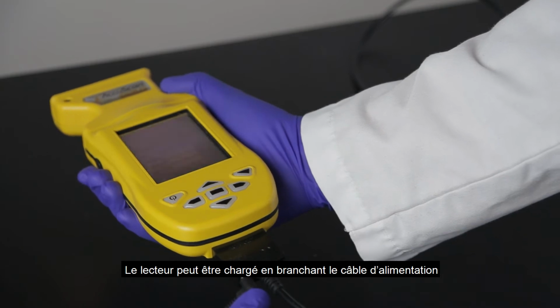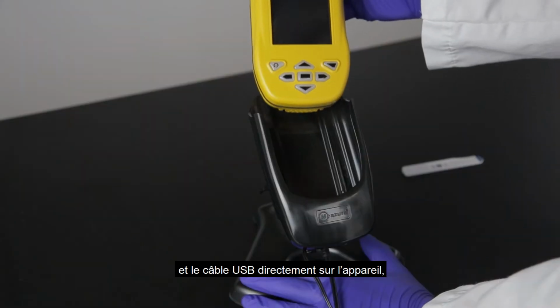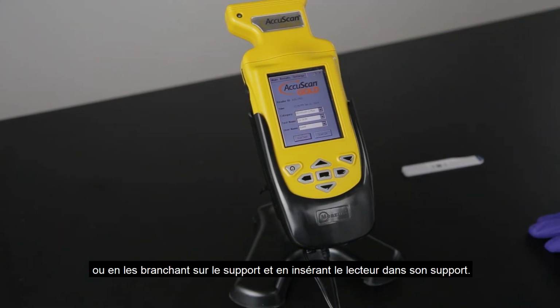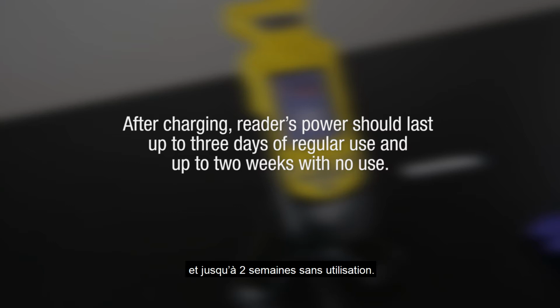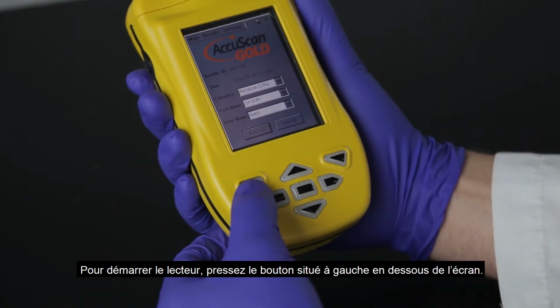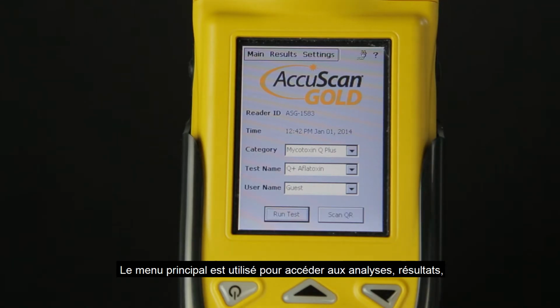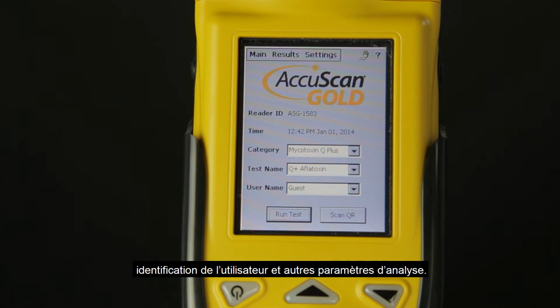The reader can be charged by attaching the power cord and the USB cable directly to the reader, or attaching the cord and the cable to the cradle and inserting the reader into the cradle. Once charged, the reader's power should last up to 3 days of regular use and up to 2 weeks with no use. To turn on the reader, push the button on the left-hand side below the screen. The main menu screen is used to access all sample testing, sample results, user identification, and other test support utilities.